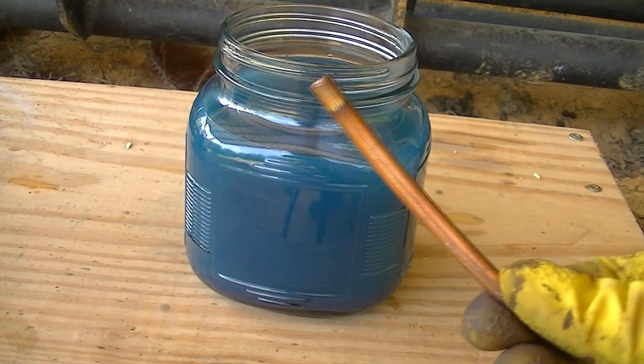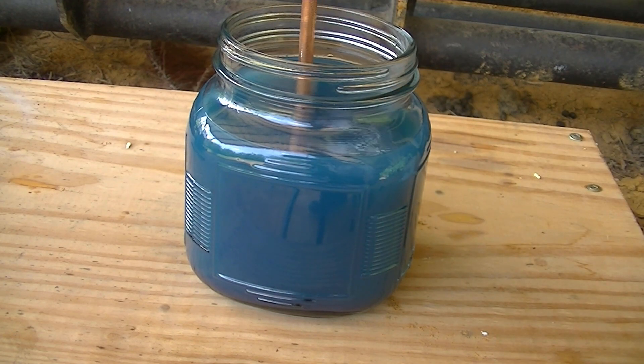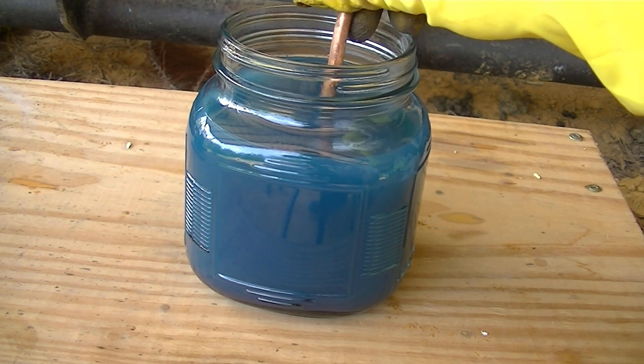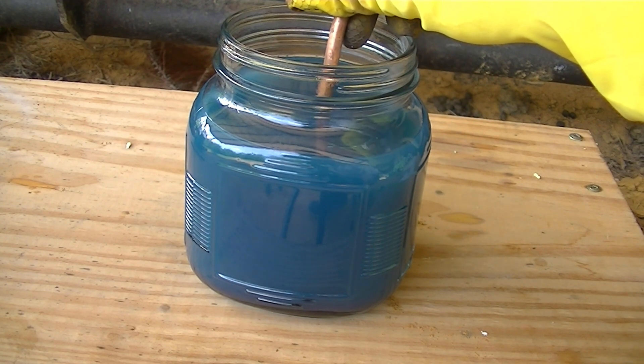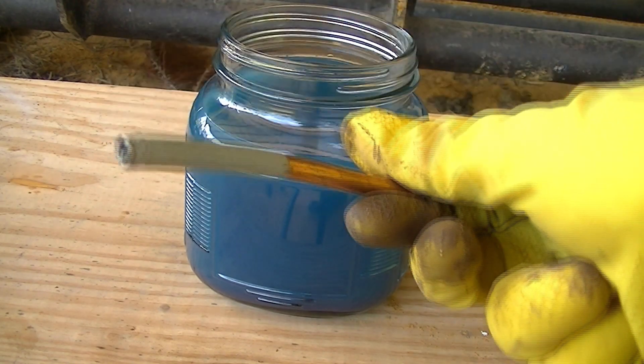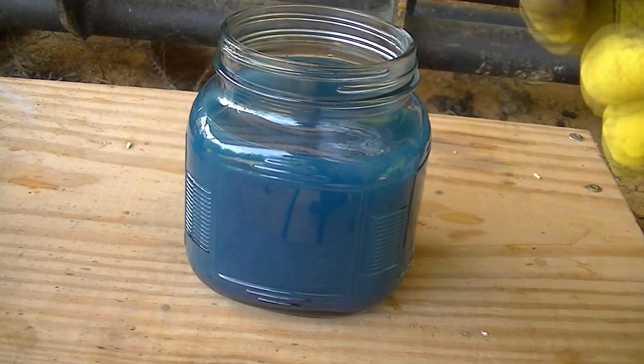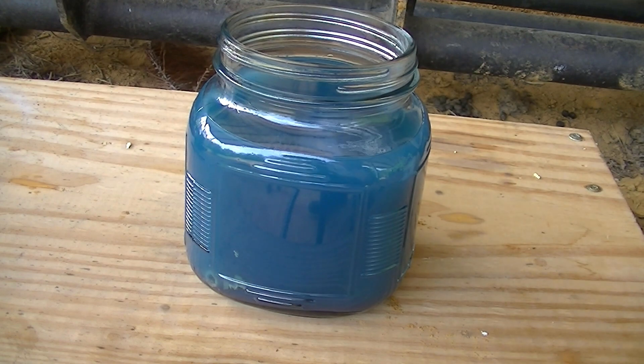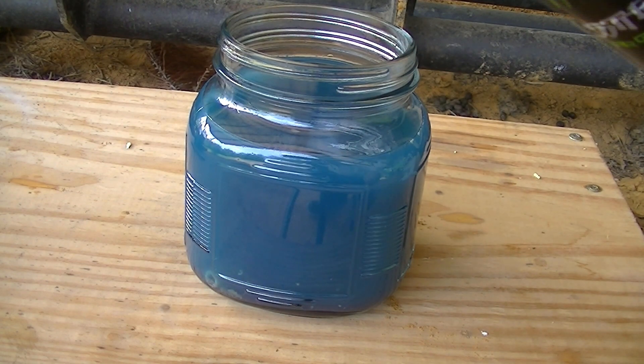Now it's time to precipitate out the silver from the solution. I'm going to do this by using copper. Now, this works because copper is more reactive than the silver, so it takes its place in the solution. This basically means that the copper will be dissolved and then the silver will crystallize in its place.